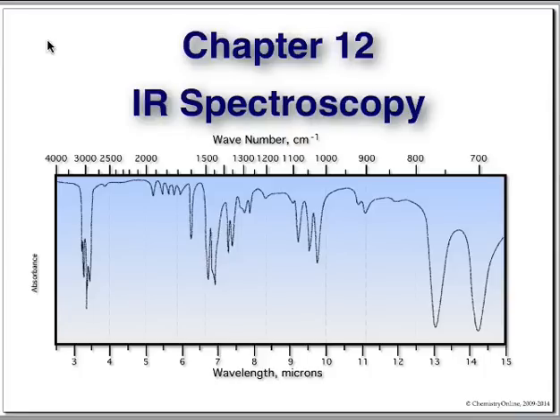When you look at an infrared spectrum, it looks like just a whole bunch of little wiggly lines. And it is. Each of these corresponds to an absorption of energy. There are two ways that you can approach spectroscopy in general. One is you can become a spectroscopist. A spectroscopist will sit there and look at these things and basically analyze every little wiggle along the way. People are very, very good at it. People can spend their life doing things like this.